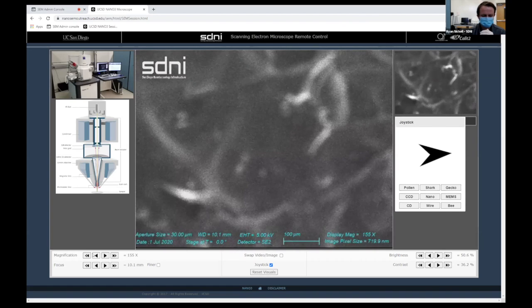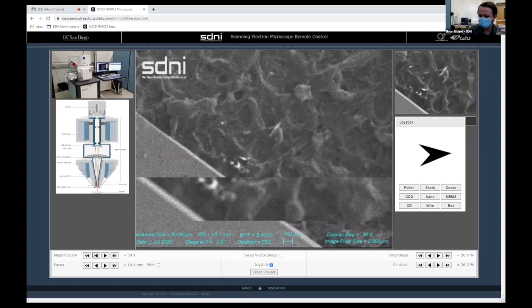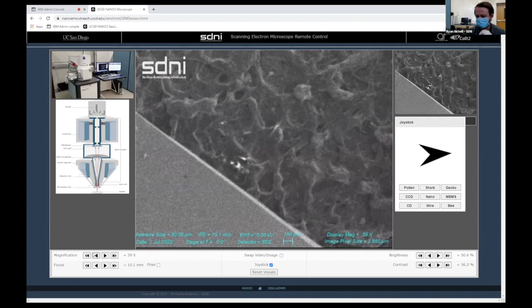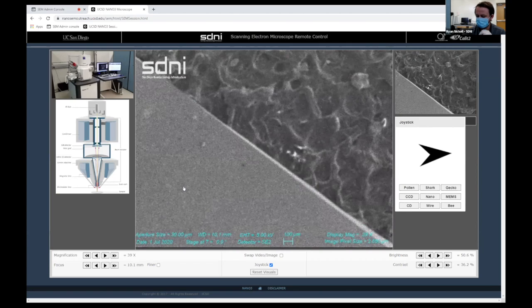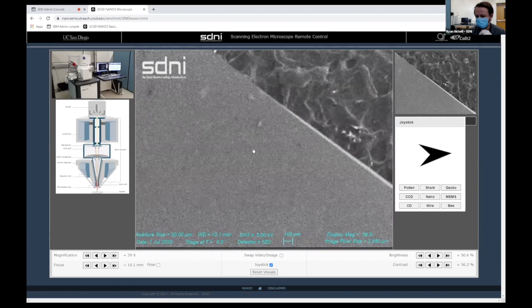That's fine. So what you're seeing is the sample is actually to the bottom left. You see the sort of lighter gray. So click that area. Do I drag it? Oh, I see. Just a single click. Yeah, you got it. So believe it or not, the samples are there somewhere.